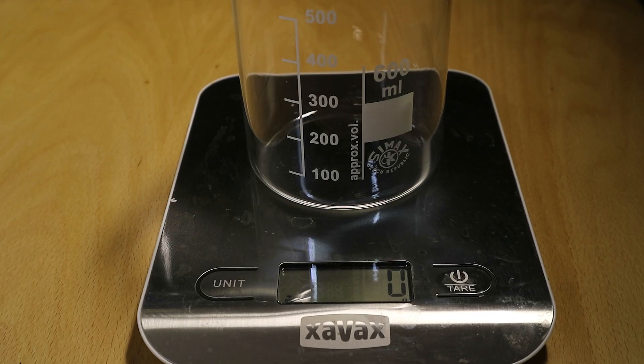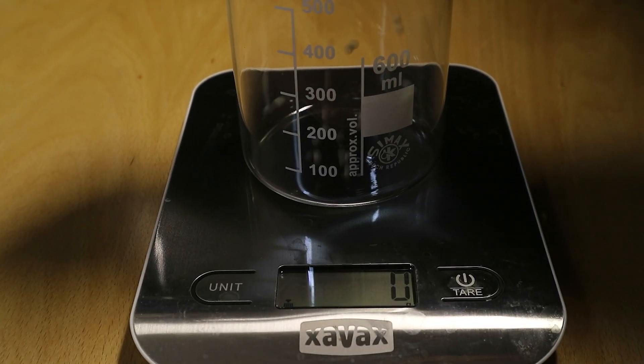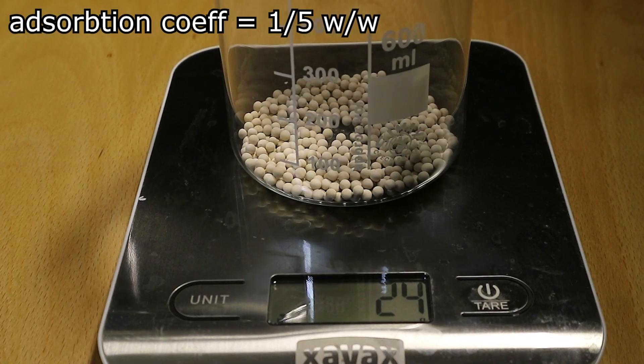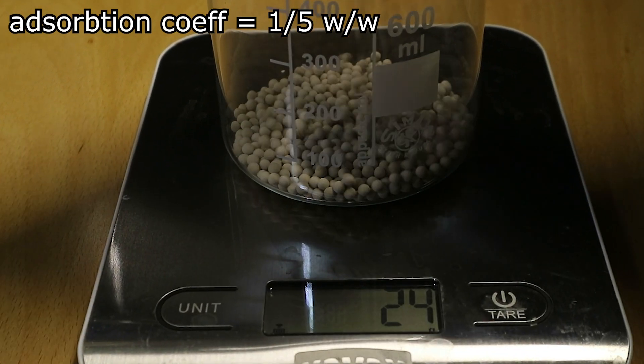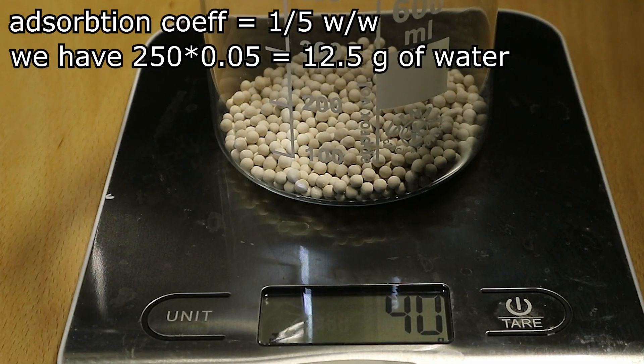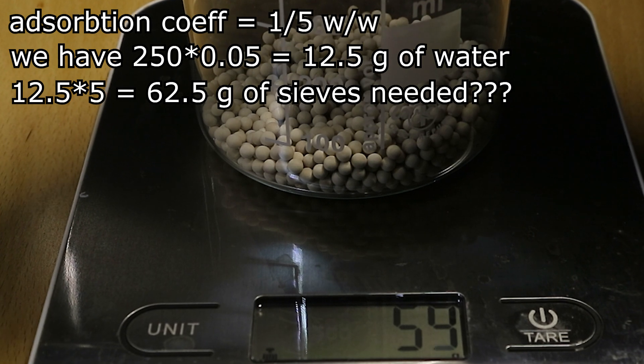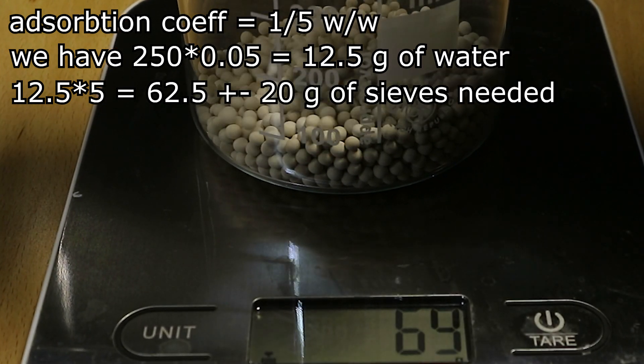For the amount that you need basically you have to take into account that molecular sieves absorb around 20% of their own weight in water and then take into account that we have somewhere around 5% concentration in the ethanol. Take that number multiply it by 5 and then as a good not chemist add a bunch extra just to make sure.